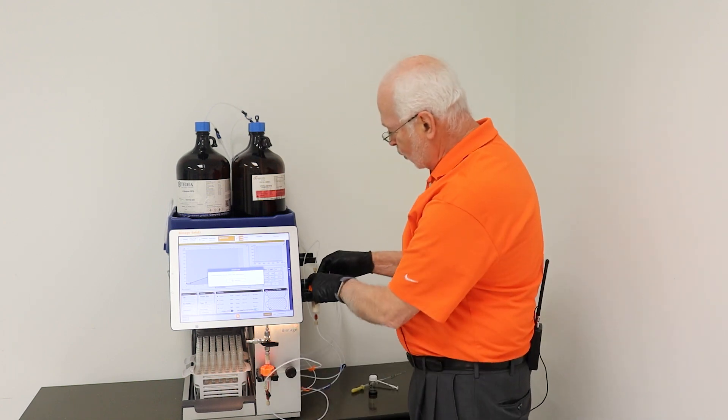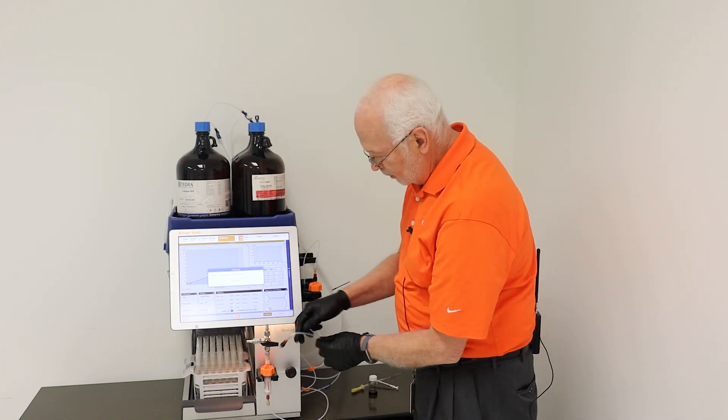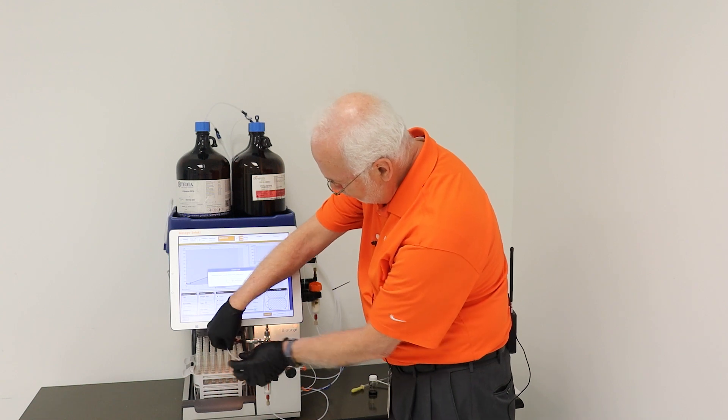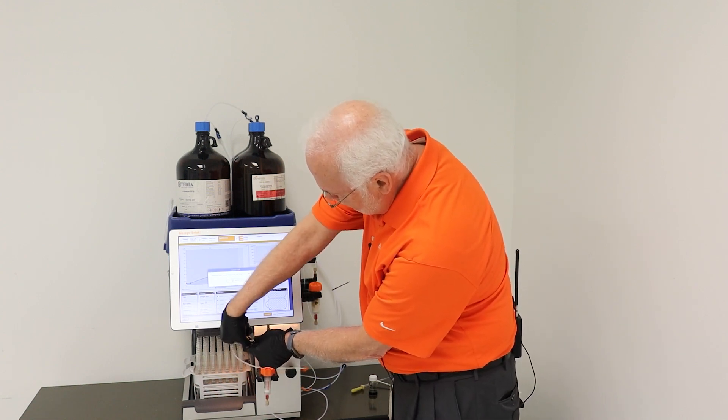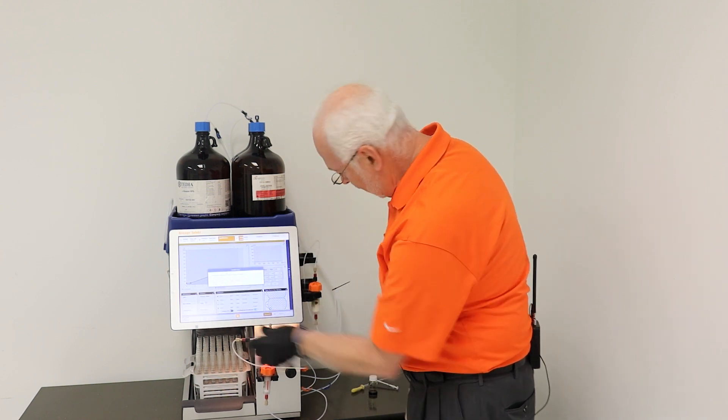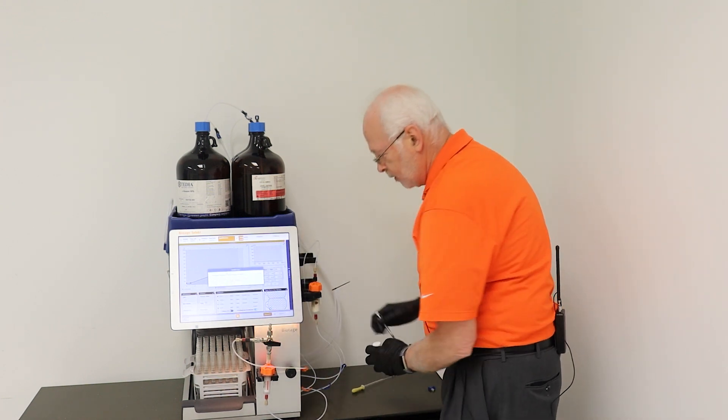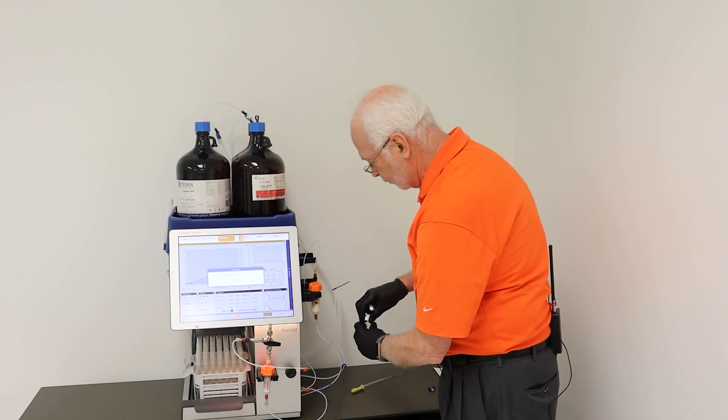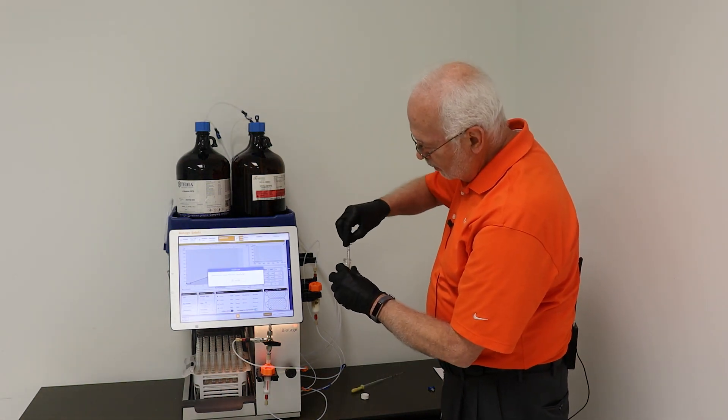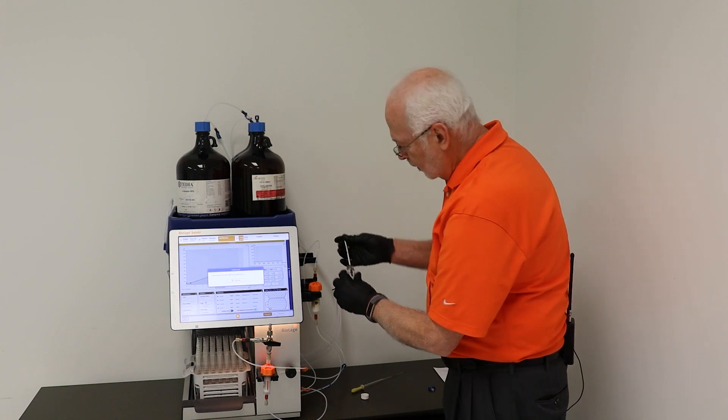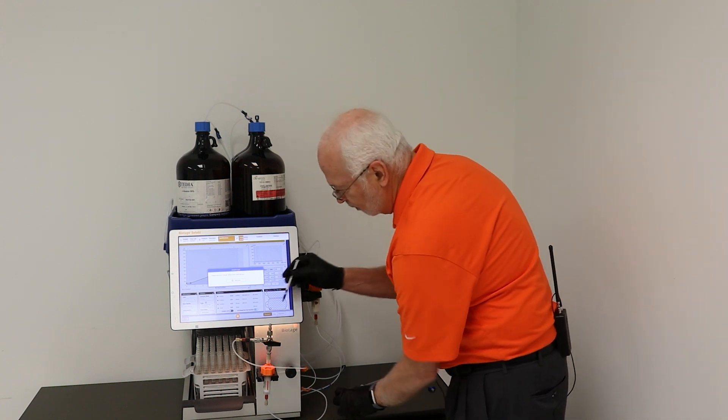You would take your solvent line and attach that to the side port, and then you can take your sample and use a syringe and do a liquid load and inject whatever volume you want.